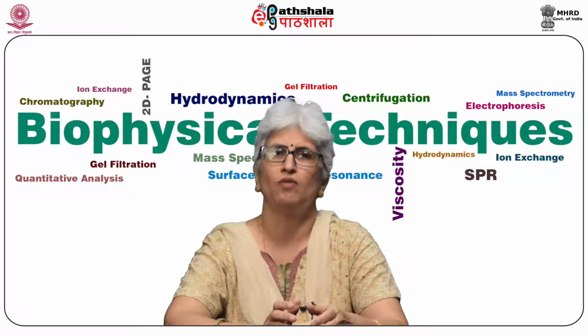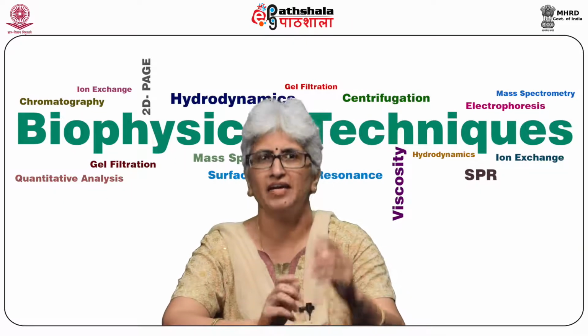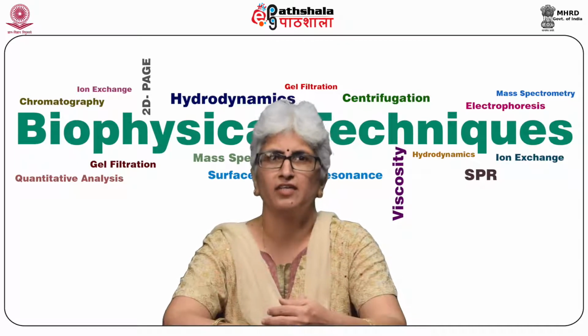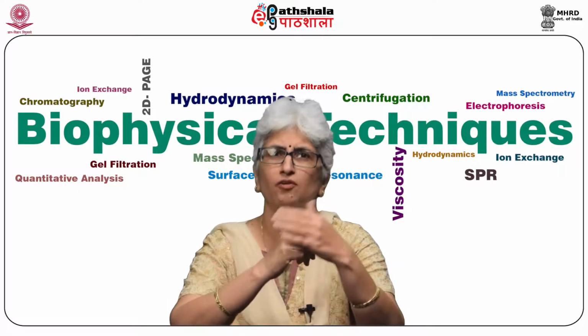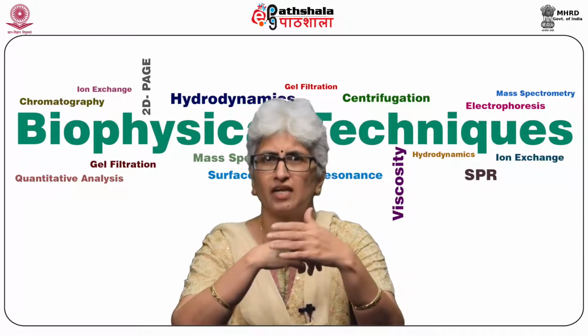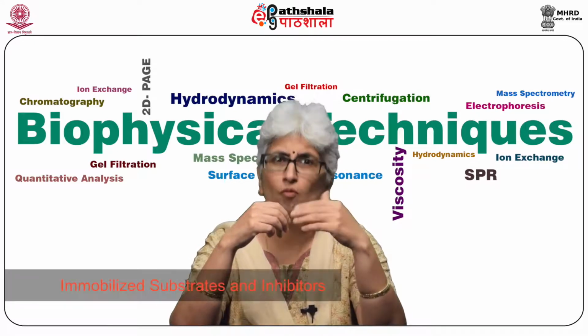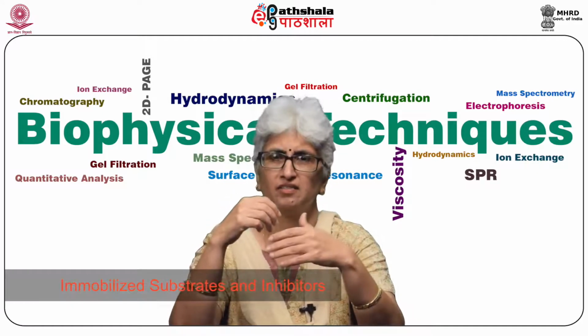So what is the history of affinity chromatography? In 1968, affinity chromatography was introduced by Cuatrecasas, Wilchek and Anfinsen, and they described a method to purify an enzyme using immobilized substrates and inhibitors.